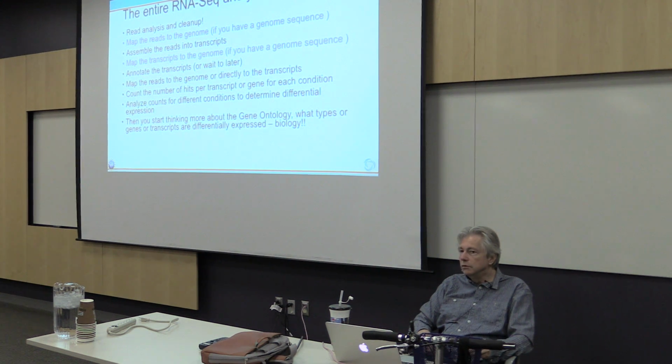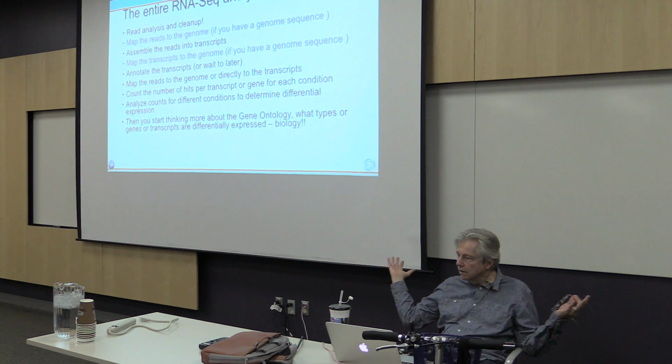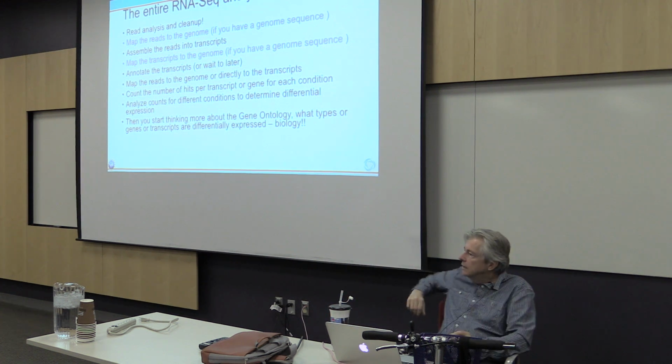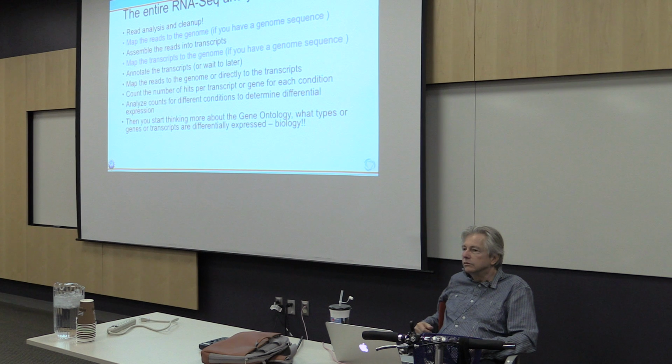Often on the ends of your reads you have adapter sequences, and you don't think so, but you often do. And you also have low quality reads, because all this information that comes into the reads is pulled off of plates that are fluorescent or light captured on film or a digital array.